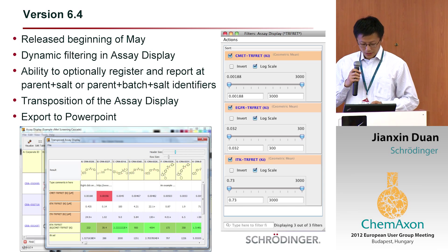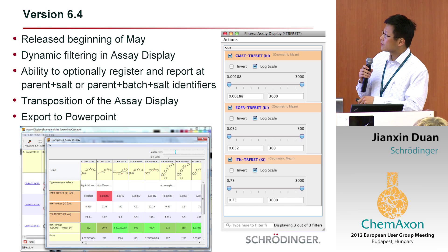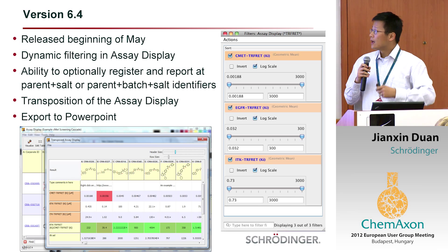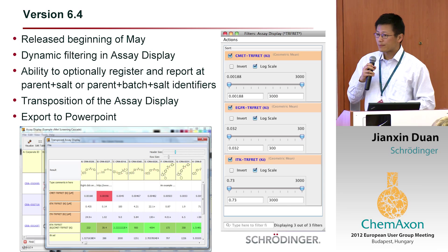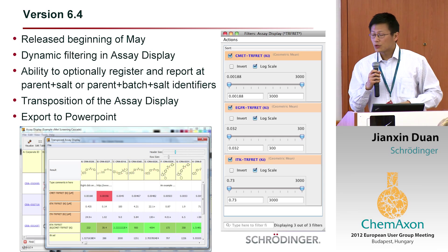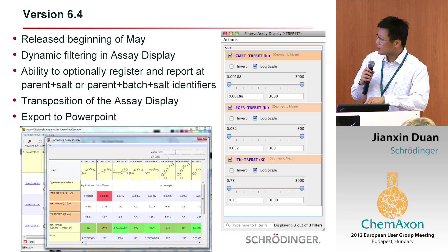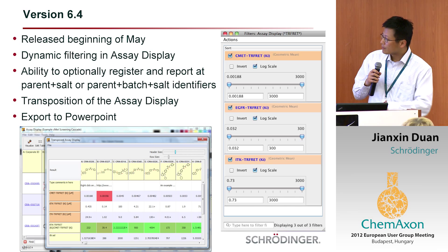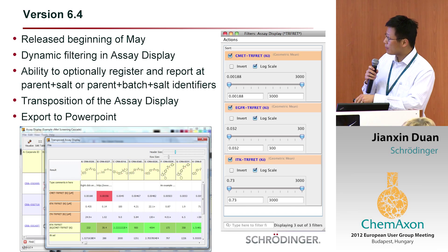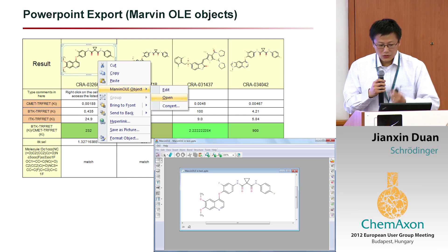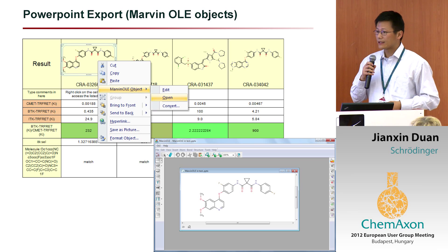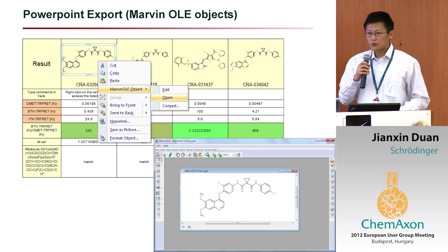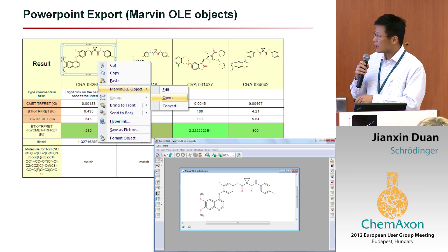Recently we came out with a new version, release 6.4. It has dynamic filtering in the spreadsheet display — earlier we had dynamic filtering for plots, and now you can do dynamic filtering and see the cells that got hidden in the tables. You can register and report at parent plus salt, or parent plus batch and salt identifiers. You can also transpose the SAR display so you have the molecules as the top row and the assays on the side. And you can export this to PowerPoint — not as a picture, but as an object. Each molecule is a Marvin embedded object, so if you double-click or right-click and choose the Marvin object, you can open up an editor to edit that molecule.